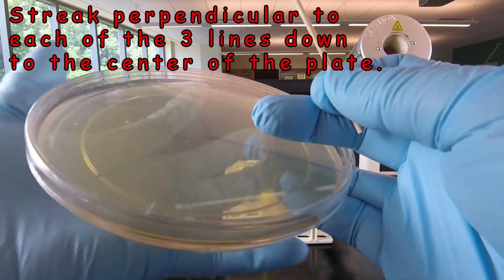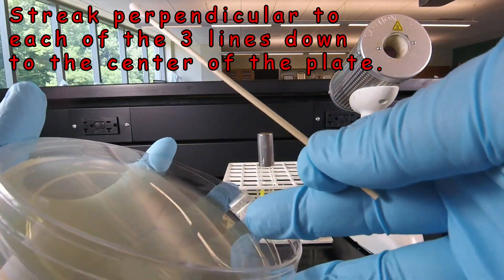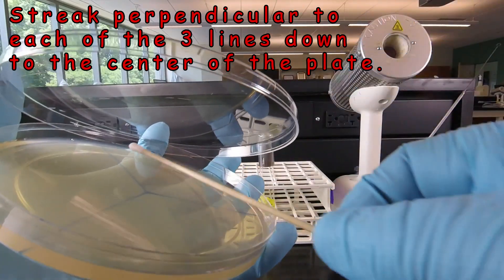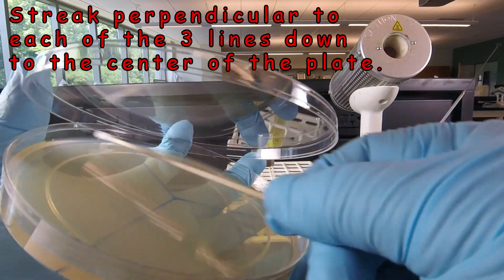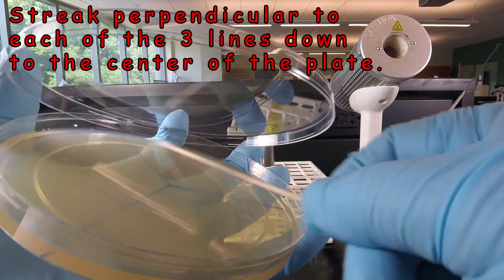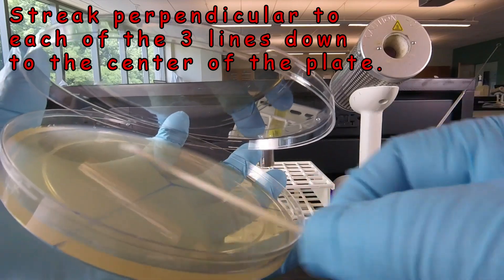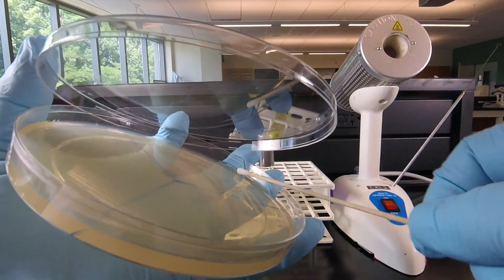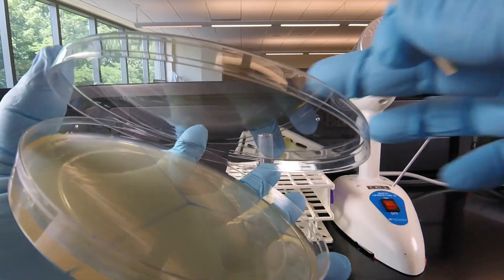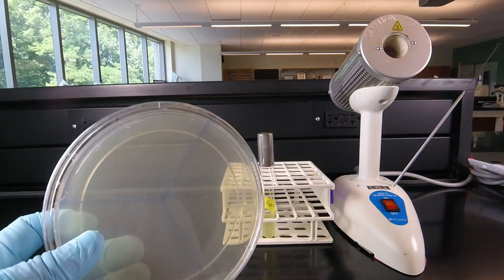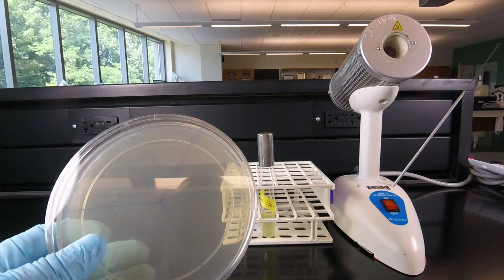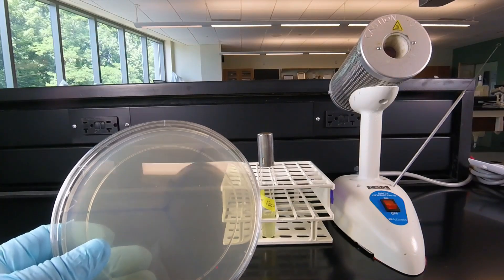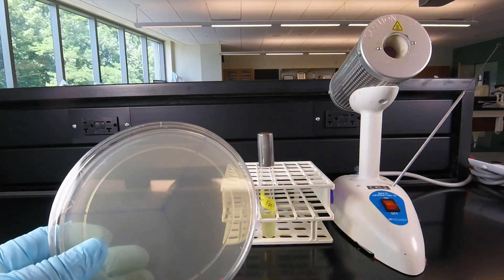And finally rotate it to the last line, and streak perpendicular to that line. All the way to the edge of the plate. And all the way down to the center. And now we've inoculated the plate, so that the whole plate will show solid bacterial growth next time.